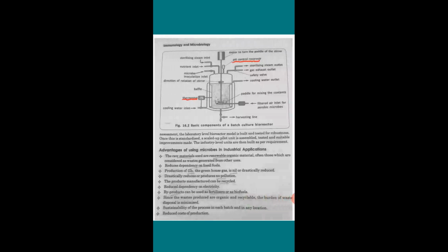Next part is the sterilization systems, to provide the convenience of in situ sterilization. In order to bring about the sterilization of the products and the whole reaction, there will be a sterilization system, and the safety valves for protection against unexpected increase in pressure, that you have seen in the case of a pressure cooker. There will be a safety valve. Here it is.